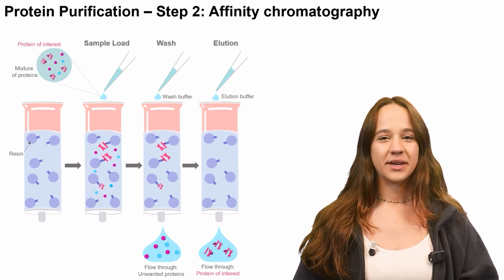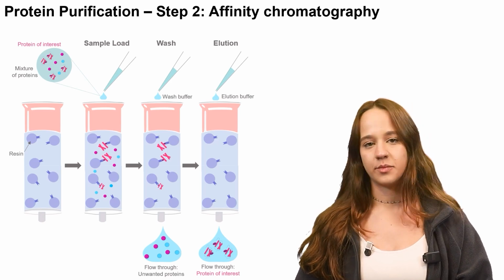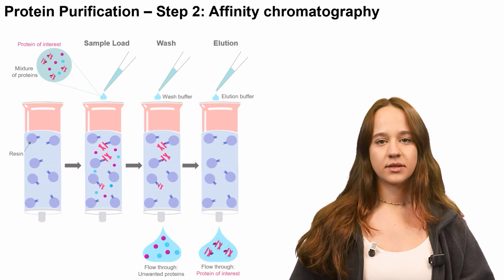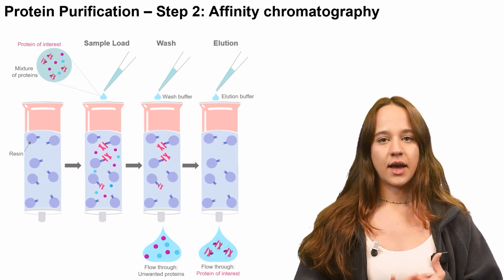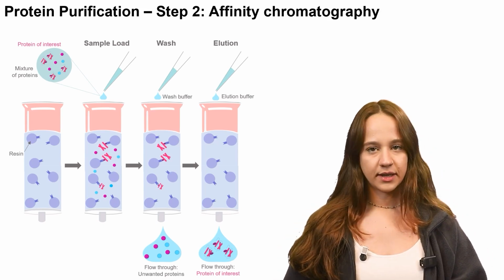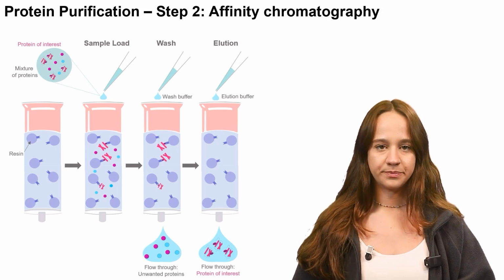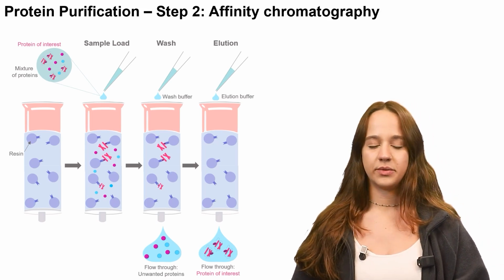Recombinant proteins expressed in bacteria are generally designed to encompass a tag that allows for the separation from the E. coli proteins using affinity chromatography. The most commonly used tag is the polyhistidine tag, which consists of 6 consecutive histidine residues added to the sequence of our protein, either N or C terminally. This tag binds nickel ions with high affinity and therefore allows us to selectively purify our protein through affinity chromatography on a nickel column. Our protein will be retained on the column, while most bacterial proteins won't be retained.